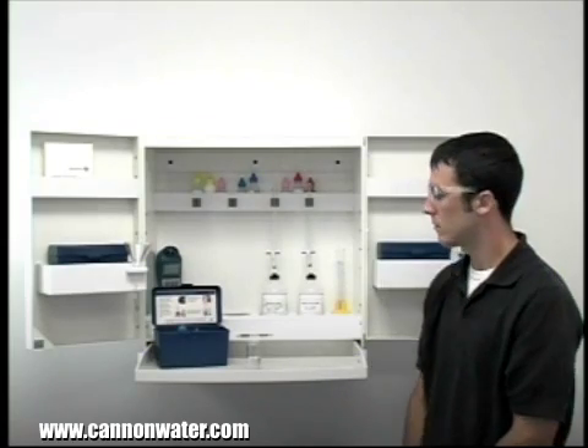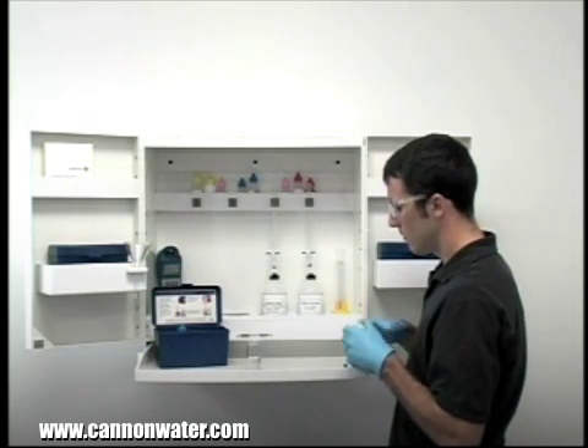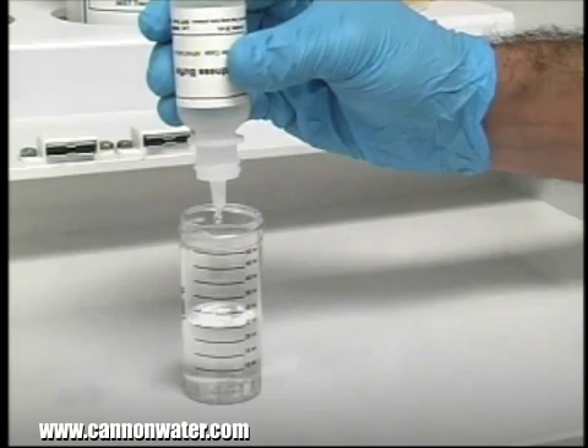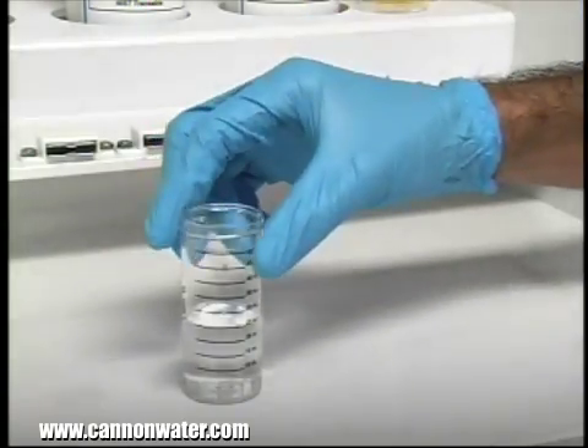The next step according to the endpoint ID procedure is to add five drops of hardness buffer. The bottle contains a dropper tip, so it's important to hold the bottle vertically to get a consistent drop size. After the addition of each reagent, it's important to swirl the vial to make sure the reagents are properly mixed.